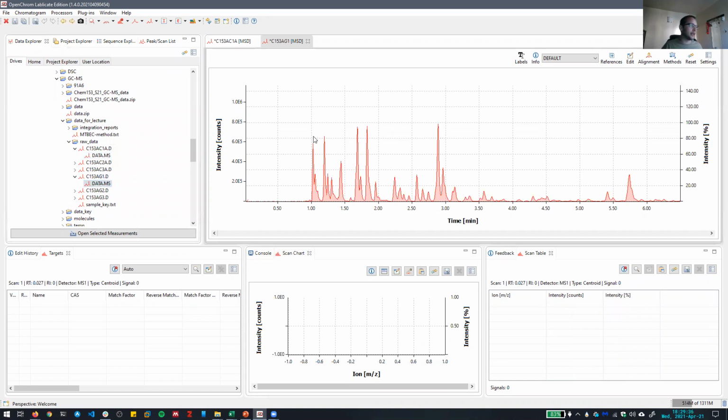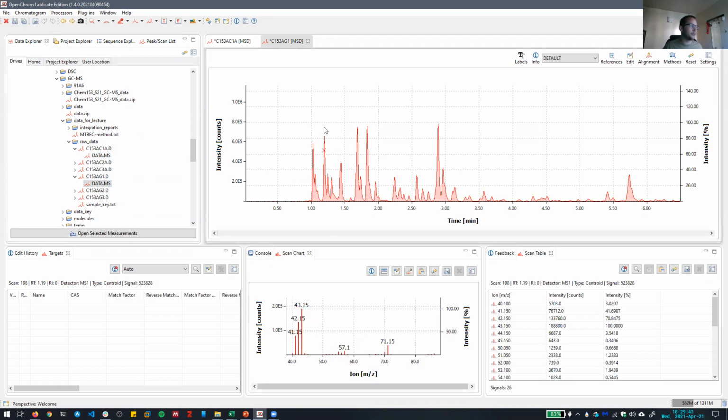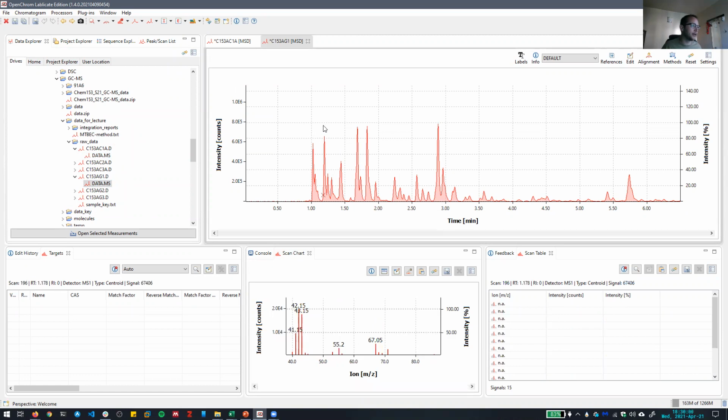And so if you go through and kind of click on each of these, you'll see that the stuff that makes them up is something else. And so what you'd have to do is go through each one of these peaks and find the ones that correspond to the correct retention time and the correct mass to charge signal. So all these ones I clicked so far, right, they don't correspond to anything that we're expecting. Well, let's see if I can get the peak of this one better.